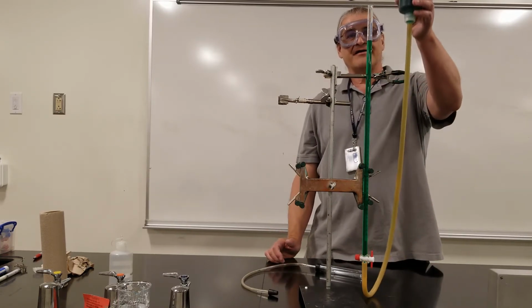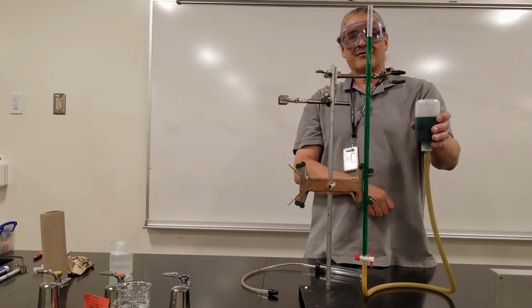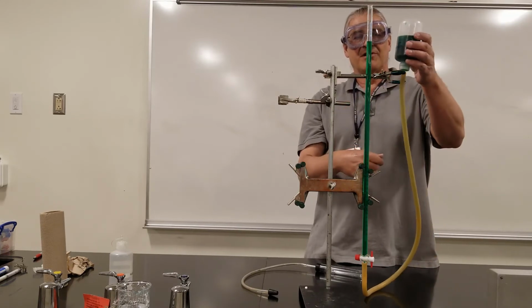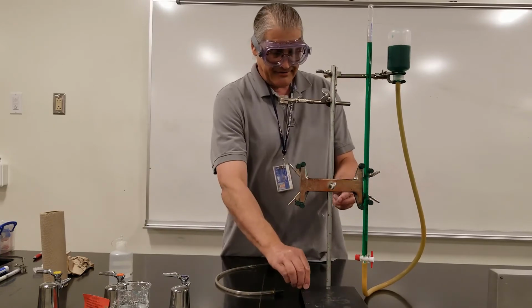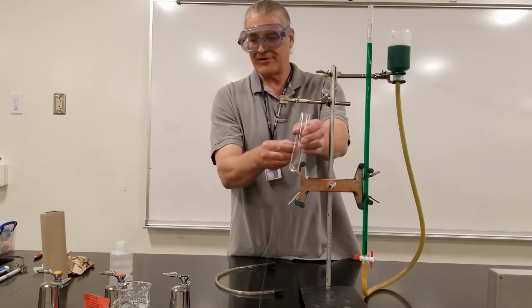And you can see if I raise this up, the water level goes up. If I lower it, it goes down. This is called a leveling bulb. So you start this procedure with your Alka Seltzer in a tube. That's our reaction chamber.